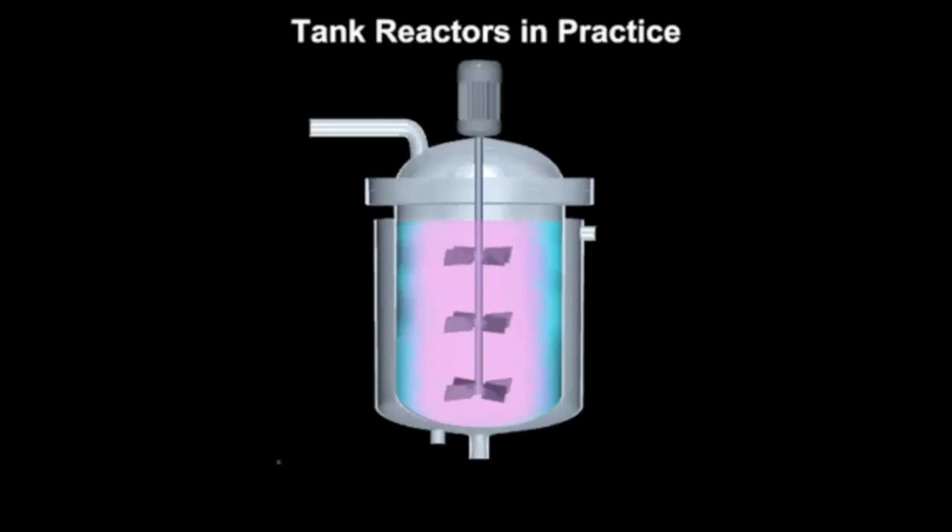So you wouldn't be able to make as many cells for the cost. Stirred tank reactors are used today in cultivated meat R&D and pilot plants. The question is, are those types of bioreactors going to make it into the production stage for large-scale projects, or are we going to need to move to other forms of bioreactor designs? I don't know the answer to that question. As we can see from all these companies, many people are experimenting with that.